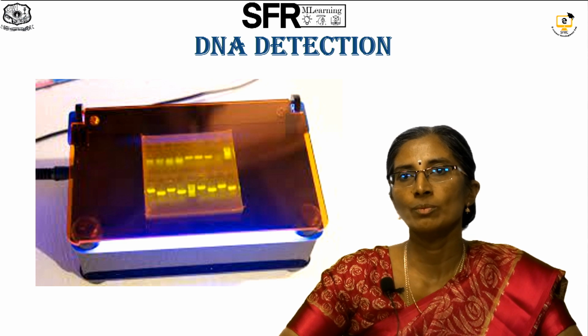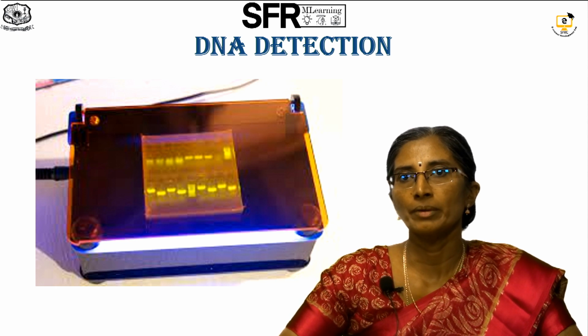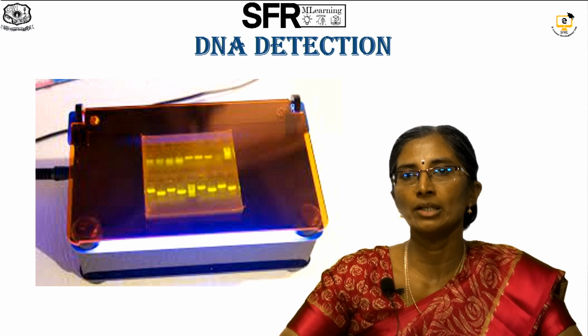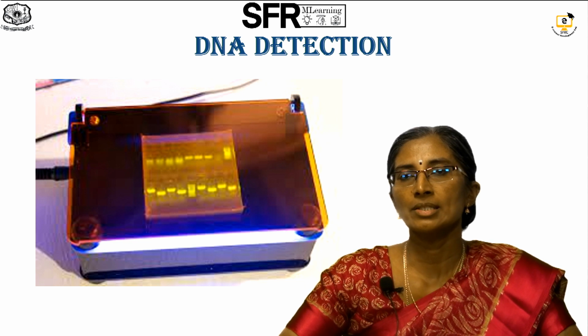So the UV transilluminator is an instrument which will provide the UV under which we will place the gel, and the ethidium bromide we are using for staining the gel will intercalate with the DNA molecule. And when you are observing under UV, it will illuminate and show an orangish band, by which we can confirm the DNA analysis, which is the prerequisite for all the forensic science experiments we are doing.